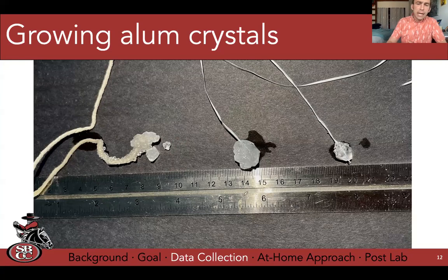And so what we see is our three crystals. We have all of that little seeding here. On the seed crystal, we've got maybe a nice growth, but really small crystals grown here, probably because we lost a lot of our growth along the string. Our two floss examples clearly grew the best crystals.